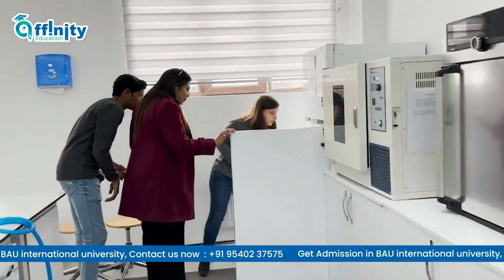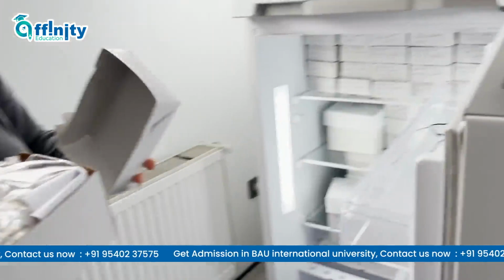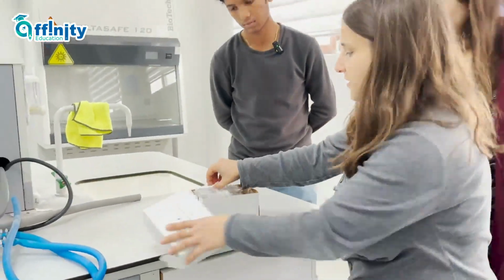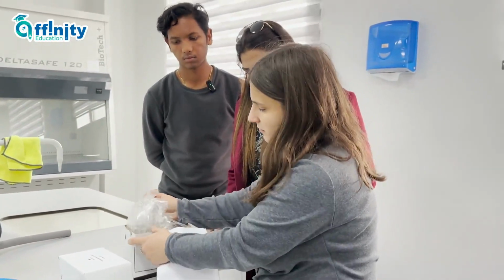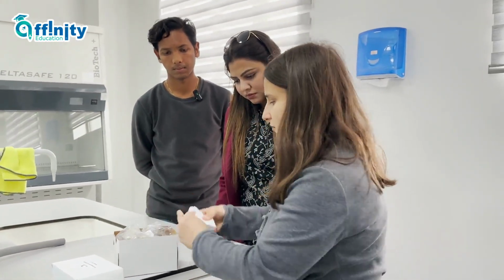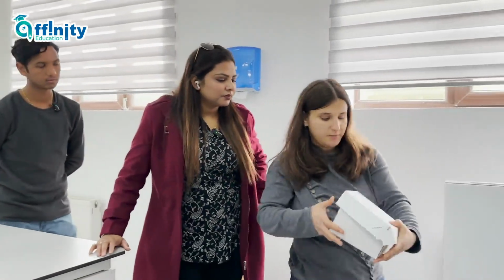For example, one of the things is medium preparation. For each group, there are 3 people, and they are doing microbiological labs. With these kits, you see their instructions, how to do it, and everything. And students are doing labs according to those kits. Okay. This one of them is for medium preparation.